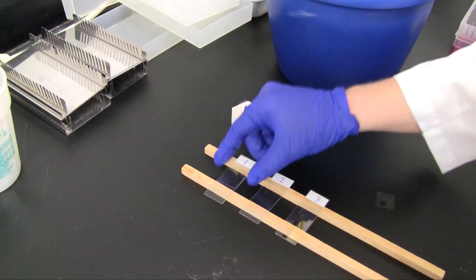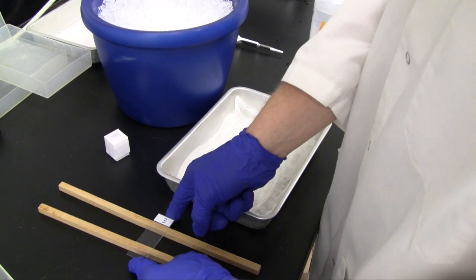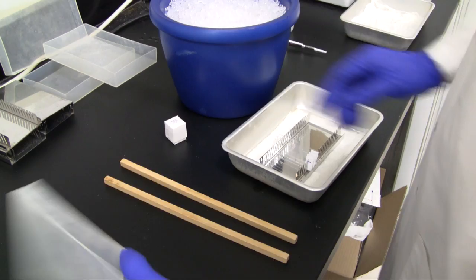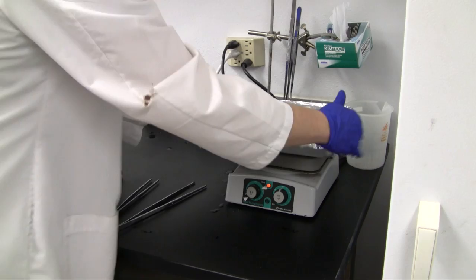An aluminum pan is layered with chem wipes and moistened with water to prevent slides from drying during the boiling process. Slides are placed either directly on the wet chem wipes or in a metal slide rack and covered with a plastic tray. While heat transfer is improved by placing slides directly into the pan, slide racks allow a larger number of slides to be processed at the same time. The pan and slides are placed into the boiling water bath and covered with aluminum foil to prevent evaporation. Slides are left in the boiling water for 5 minutes.